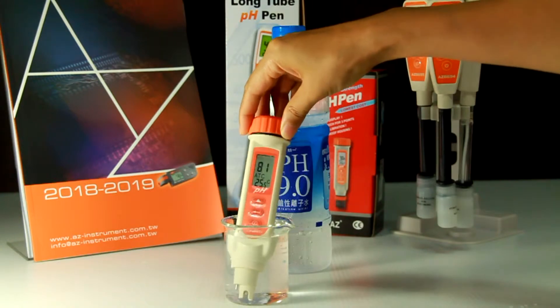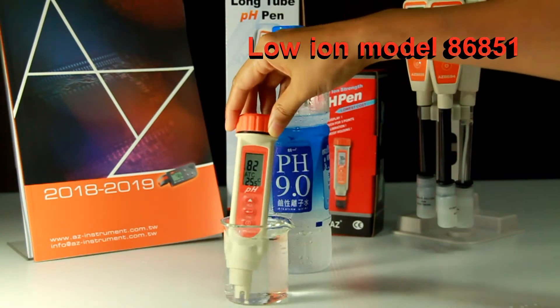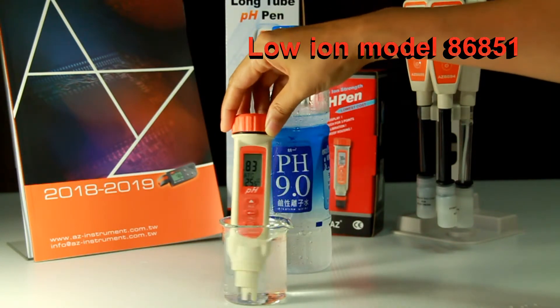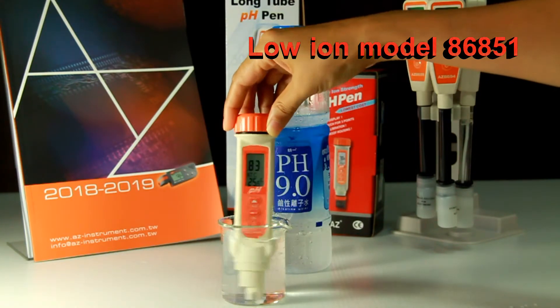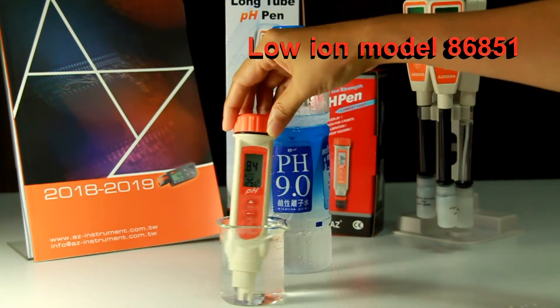To measure PH9 bottled water, you may use model 86851 low ionic strength PH electrode. Open the bottled water and measure immediately. Stir gently to get the PH value. Compared to a regular PH pen, the low ionic strength model 86851 can get a stable reading faster.